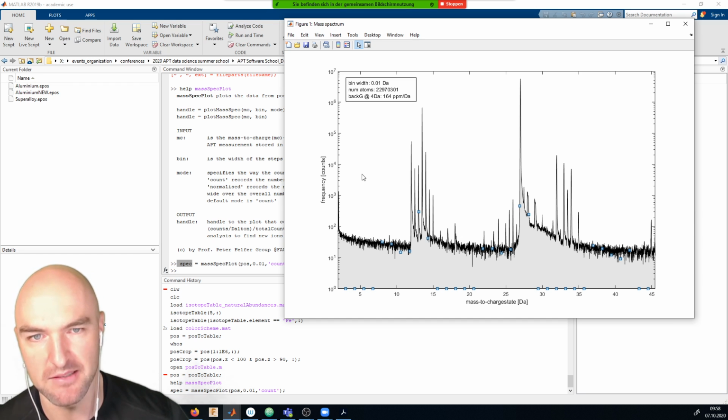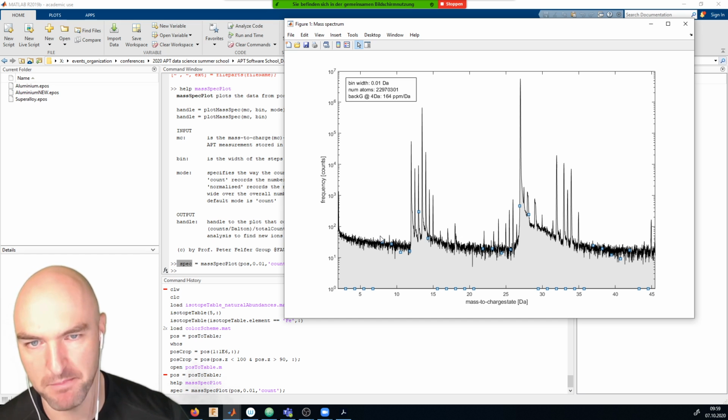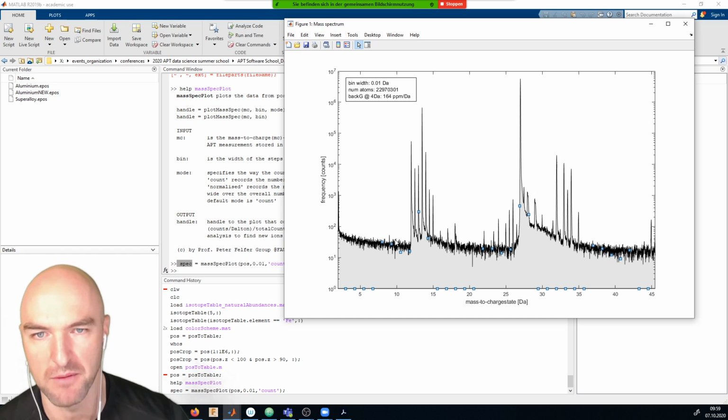The reason is very simply that very often, if we have more complex data sets, we want to compare individual mass spectra. So you can have 2 or 3 mass spectra in here, but define ranges that apply to all of those different mass spectra. Especially if you're doing electronic materials, multi-layers, and so on, this is incredibly helpful. But this means that you need to be aware that the mass spectrum refers specifically to the mass spectrum plot.